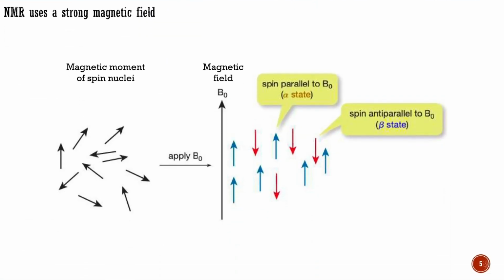In a similar way, some atomic nuclei act like tiny compass needles when placed in a magnetic field and have different energy levels according to the direction in which they are pointing. I will explain how a nucleus can point somewhere in a moment. A real compass needle can rotate through 360 degrees and has an essentially infinite number of different energy levels, all higher in energy than the ground state pointing north.